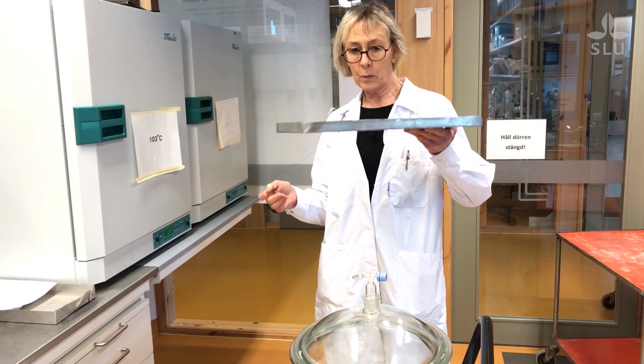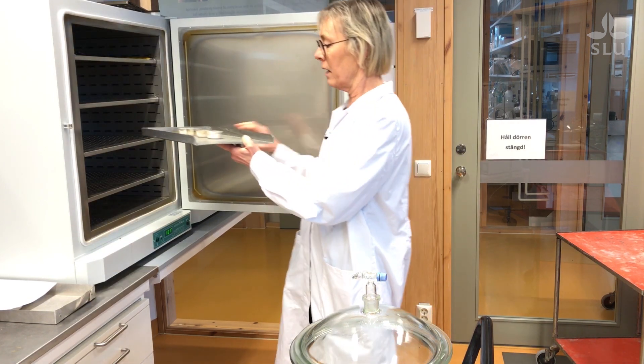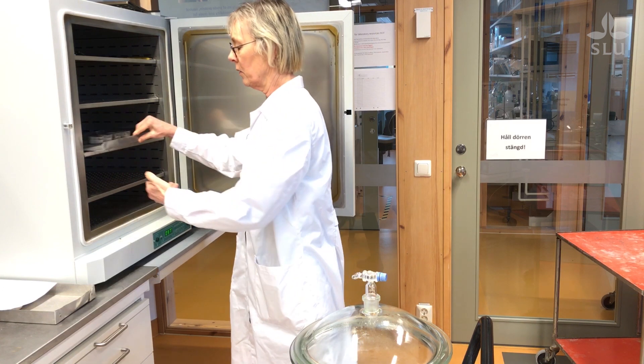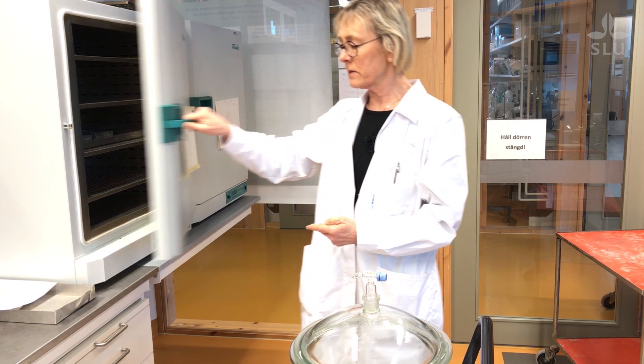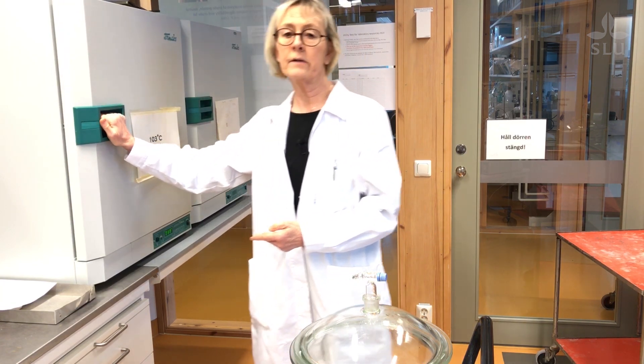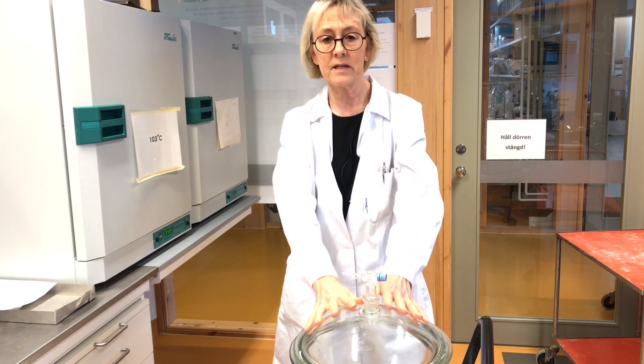Here are the samples that we weighed. We put them into a drying oven which is set to 103 degrees, and they should stay here overnight. Tomorrow morning we will take them out and put them in a desiccator.